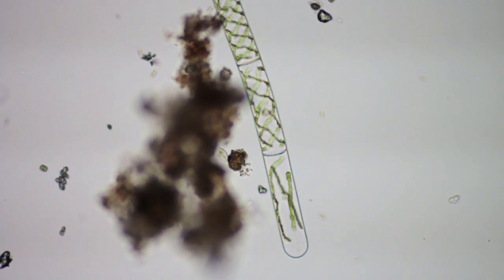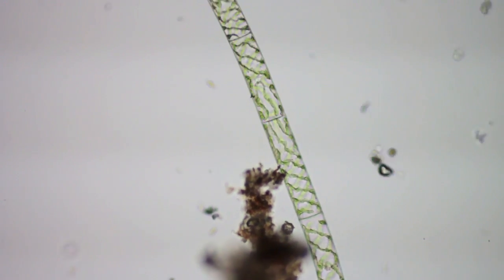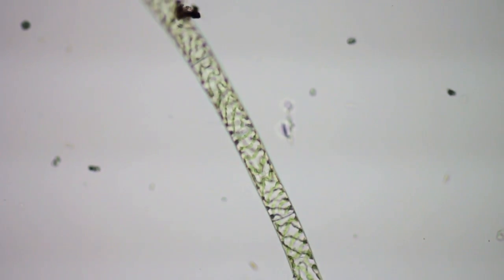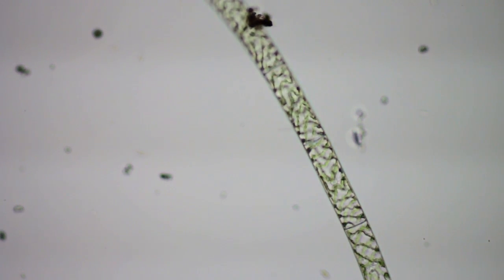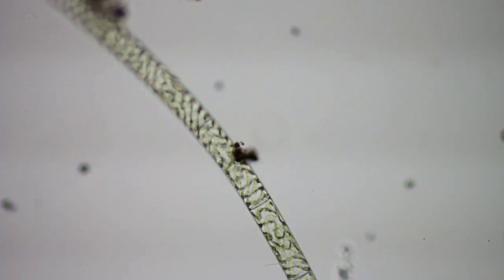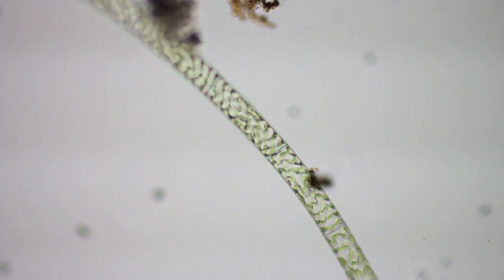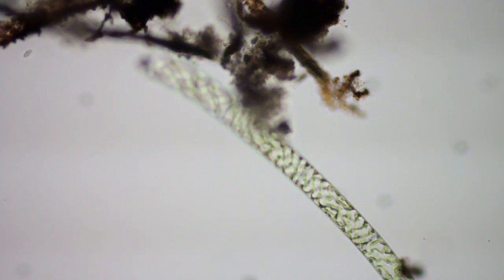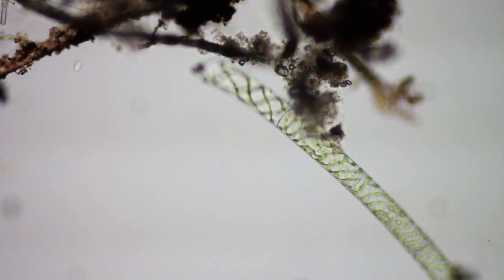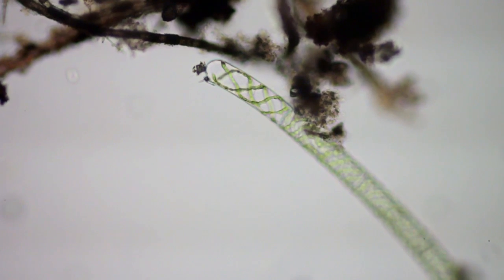It's a pretty big microbe actually - algae. Using even this low power, it's still quite a big object in the frame, so you can tell it's pretty big. It came in a sample of pond water from Mississippi, sent to me by a friend of mine in Tennessee. There's the other end.